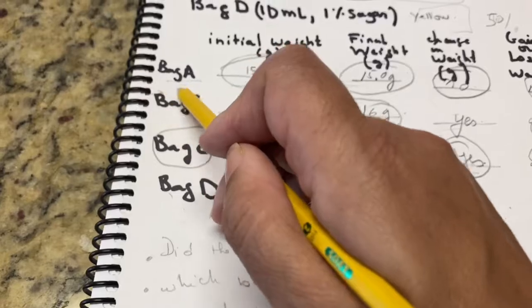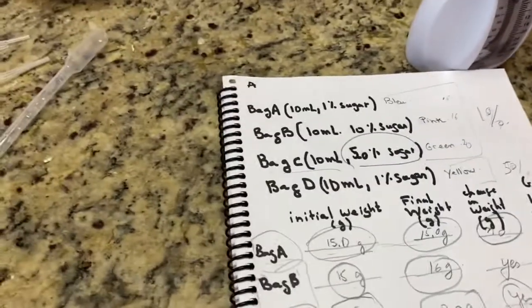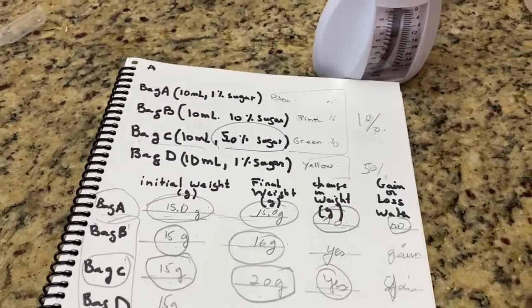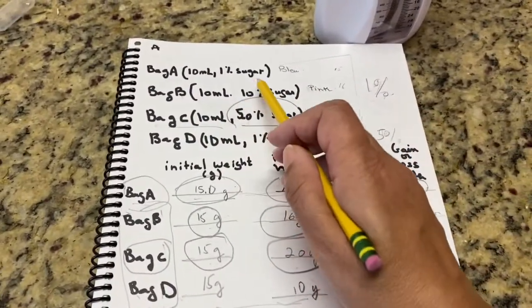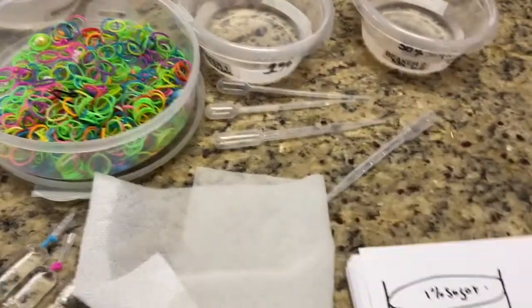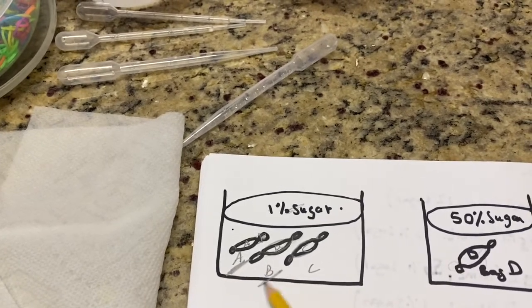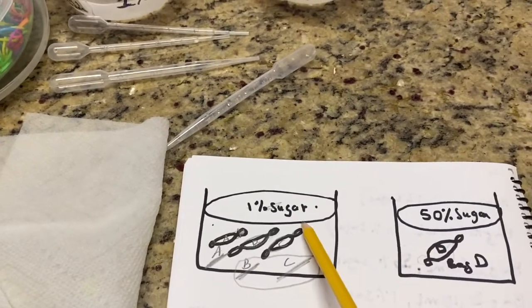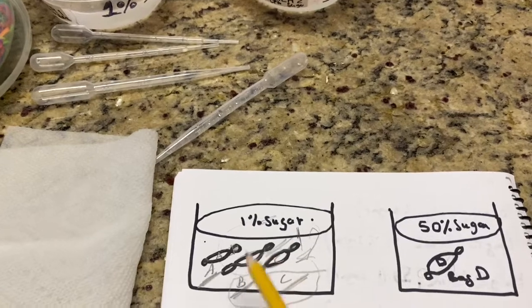So osmosis happened in almost all my bags, B, C, and D. A does not change, and the only reason is that what is inside of the bag is 1%, and I put it in 1%. So I put my bag in an isotonic solution, so there is no loss or gain of water. Bags B and C contain, if you see, B contains 10% and I put it in 1%. A contains 1%, doesn't change. B contains 10% and C contains 50%. So these two bags are very highly concentrated compared to the 1% in the container. Therefore the water will go in and those bags gain water.